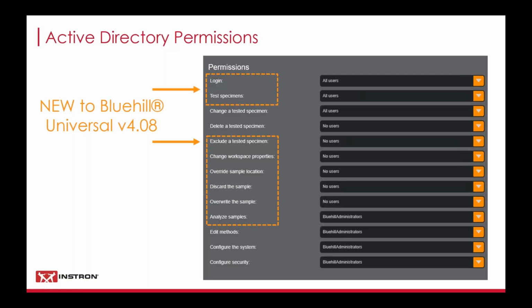So using that analyze functionality, it's very powerful if you have lots of data and you want to essentially replay that data using a different method. So that's mainly used if you have lots of results, maybe custom results that you created with user calculations.